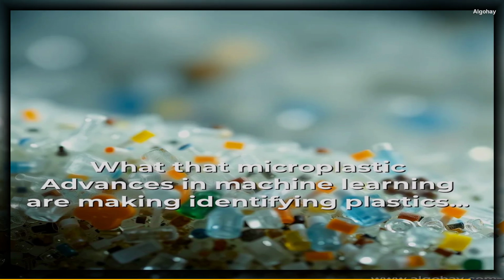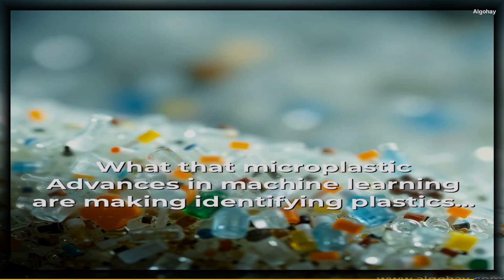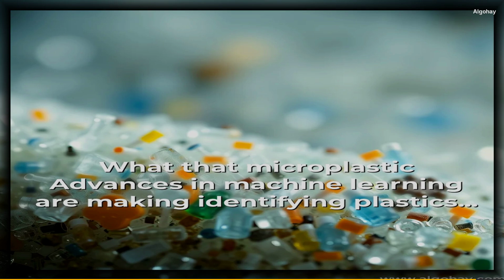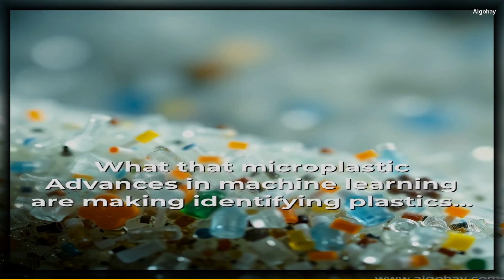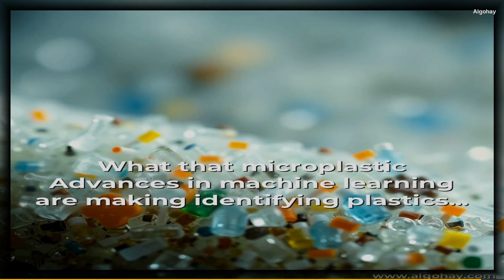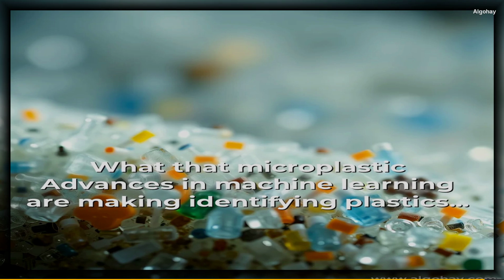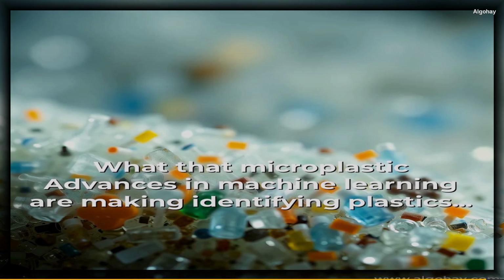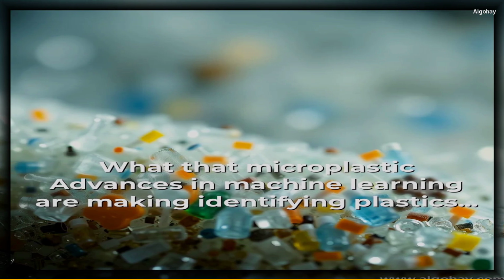Expert validation. To validate the accuracy of our algorithm, we also asked an expert to manually label the spectra with the correct polymer identities. This expert, with extensive experience in materials science, provided a gold standard for our algorithm to compare against. By comparing the results of our algorithm with the expert's manual labels, we were able to assess the accuracy of our approach.